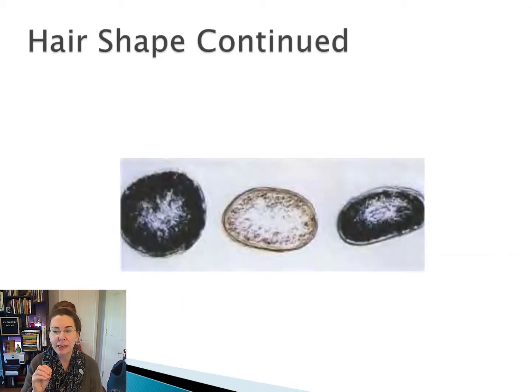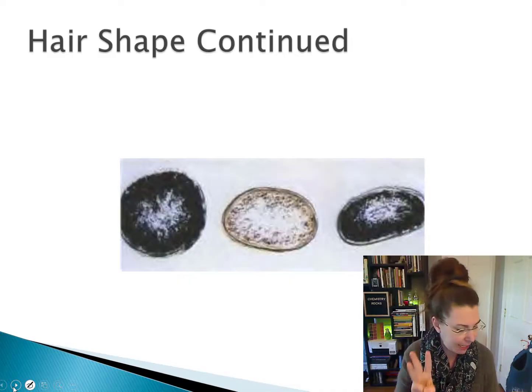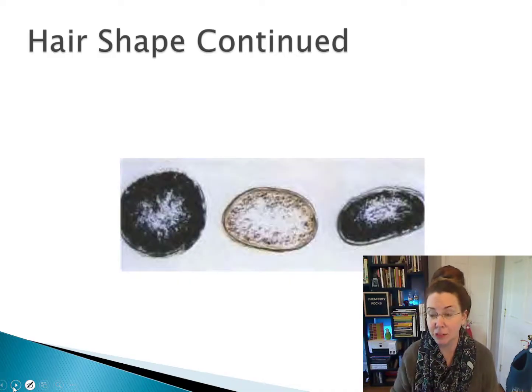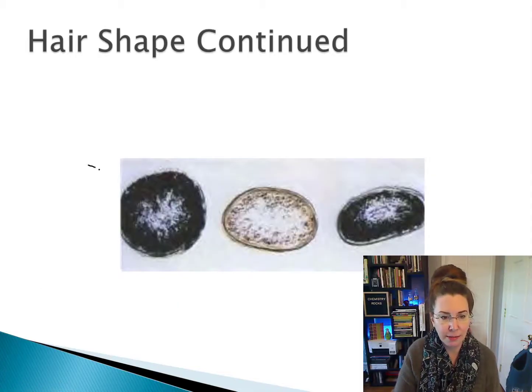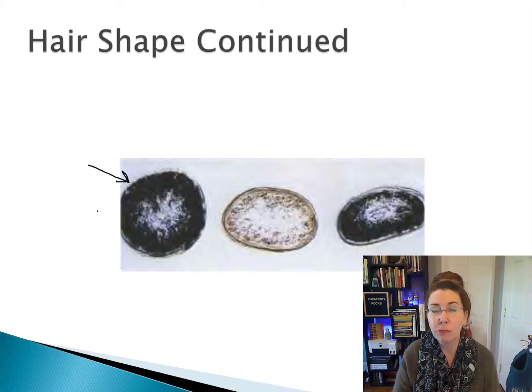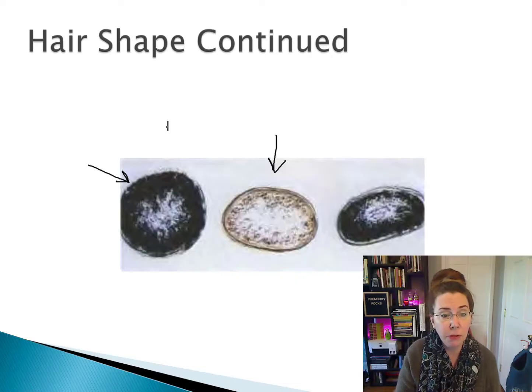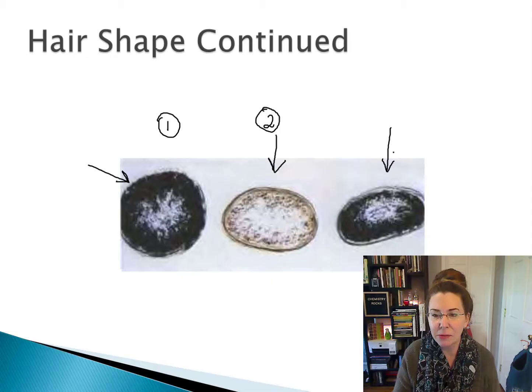This is the cross-sectional shape of three different hairs of three different textures. The first one is quite round in shape. The second one is a little bit more oval. And then our third one has that flattened edge.